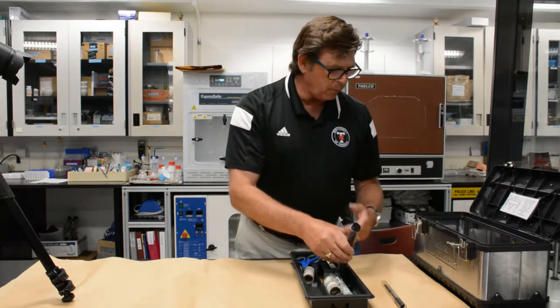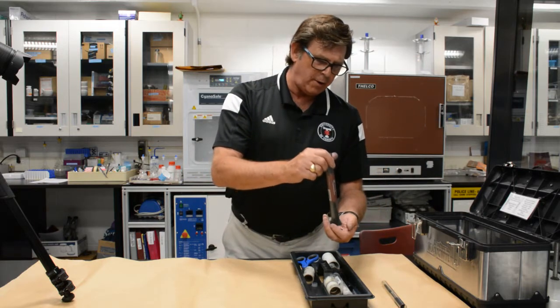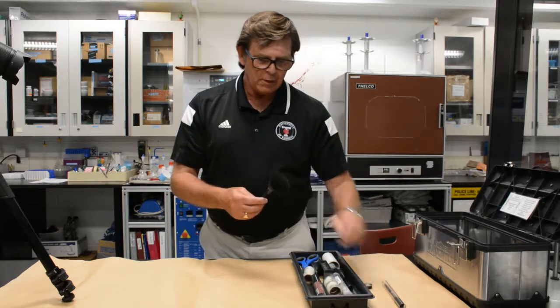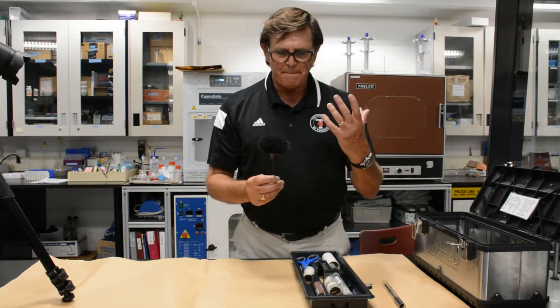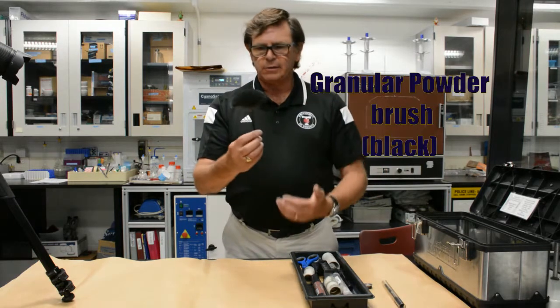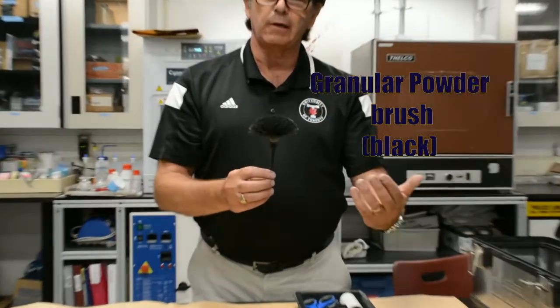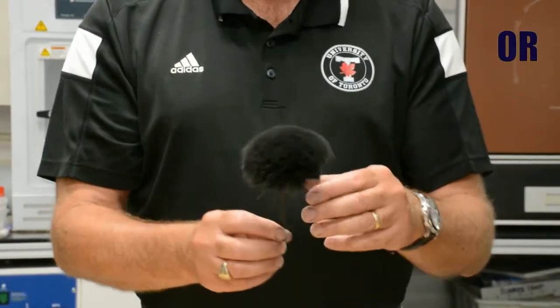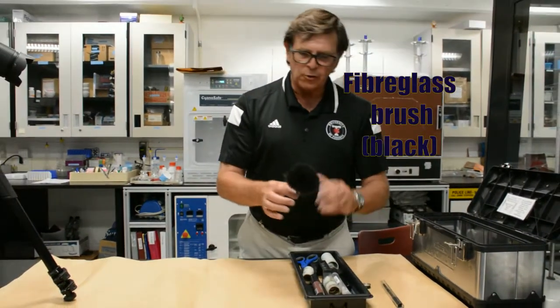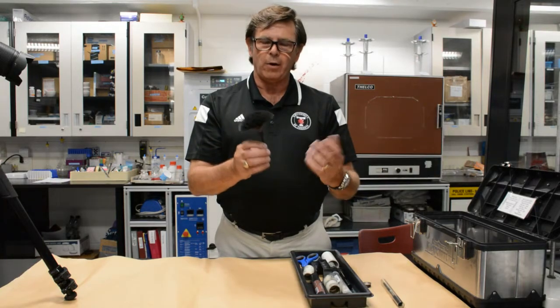Generally, with the kits that we have, there are three brushes designated for three colors of powders. Please maintain that concept, so that each brush, in this case a black granular fingerprint brush, is used specifically and exclusively with the black granular fingerprint powder. There are three of these brushes: a black one, a white one, and a gray one.